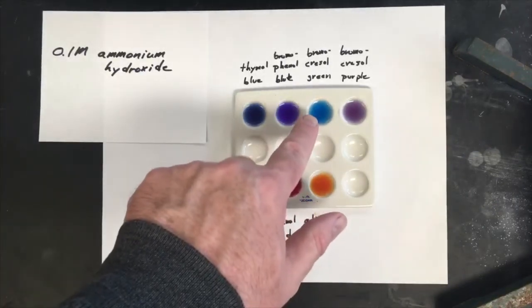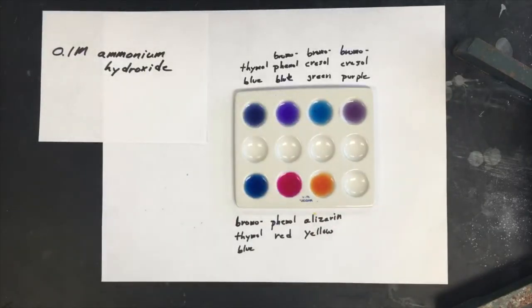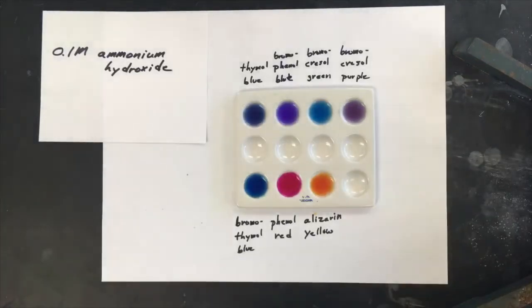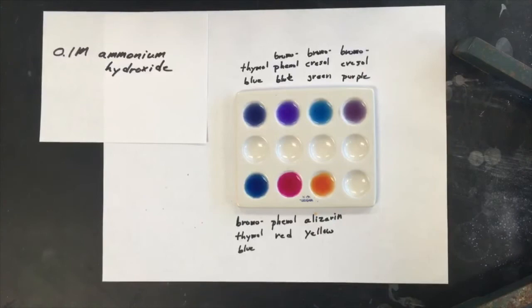Everything looks pretty good. I might have another little piece of rubber in the bromocresol green well. Let's zoom in so you can see a little bit better what's going on.